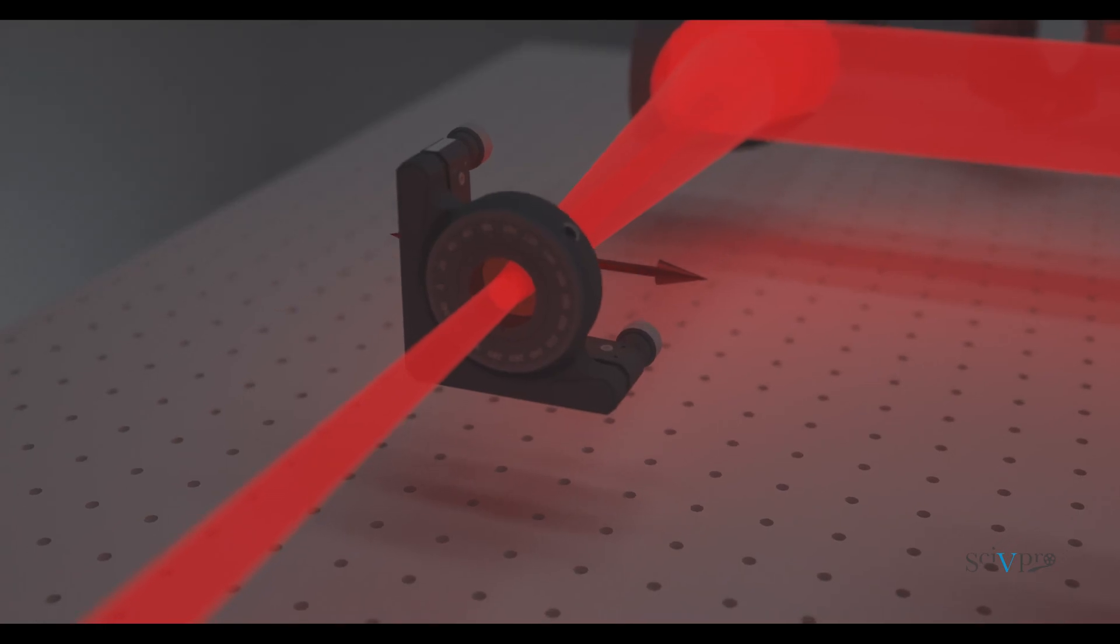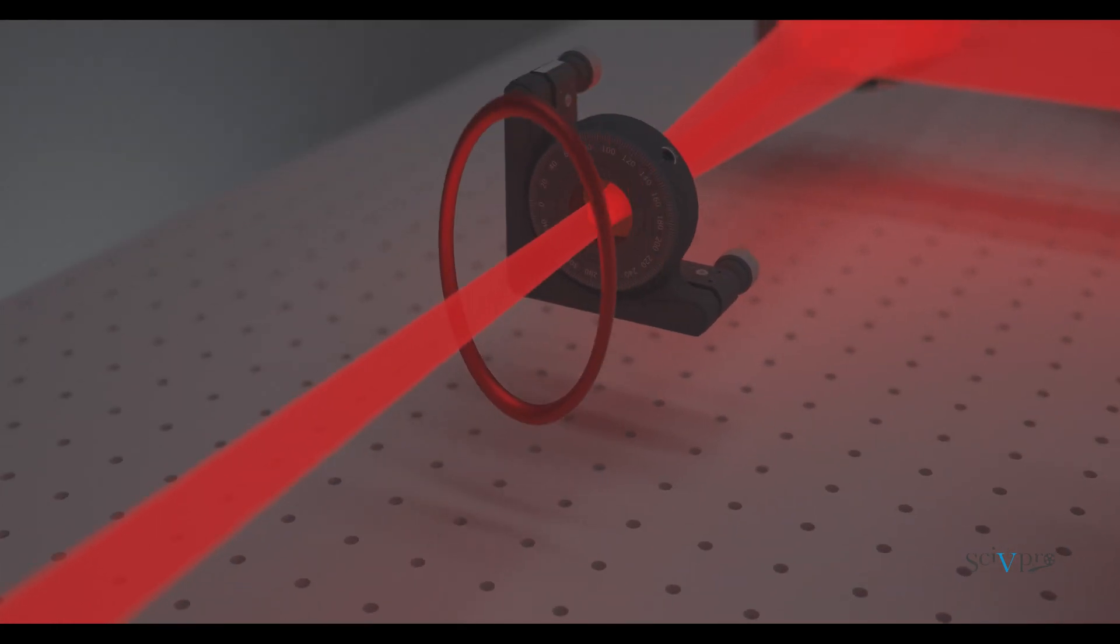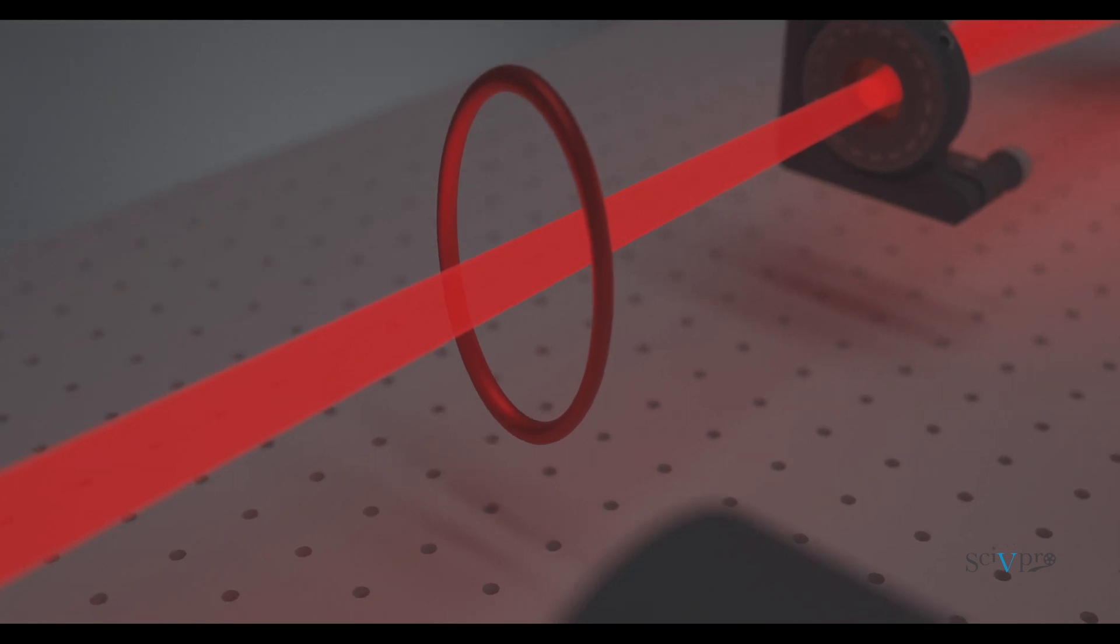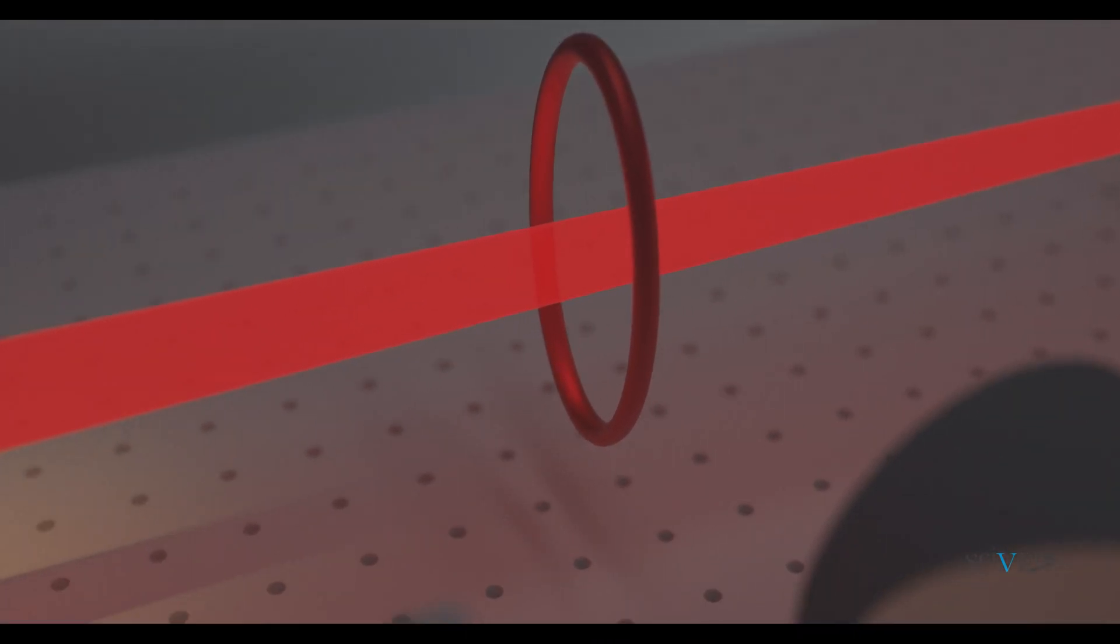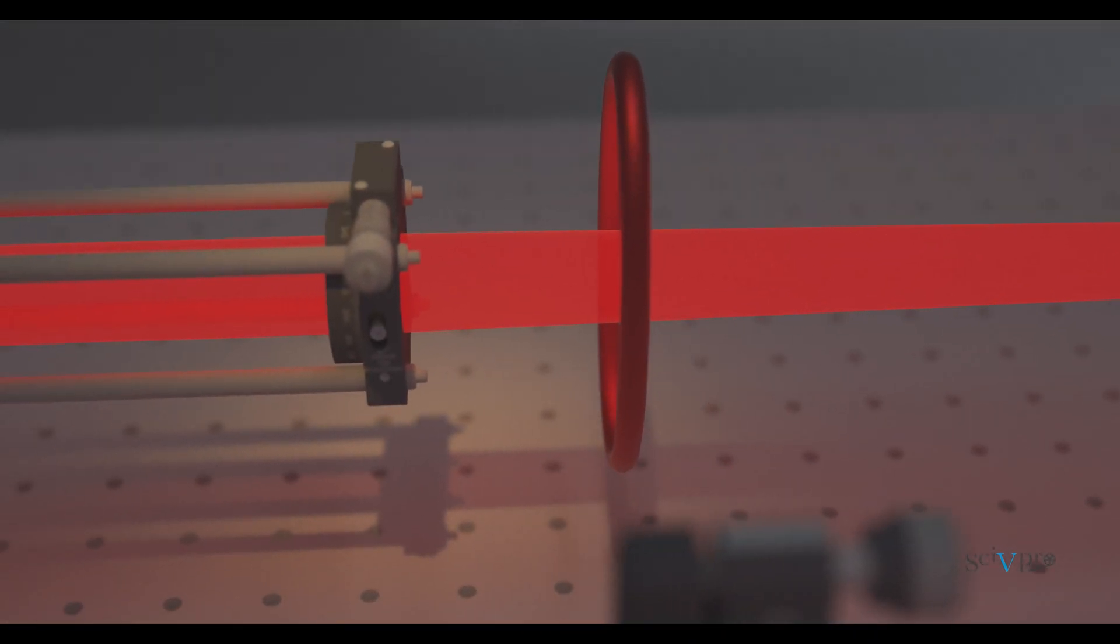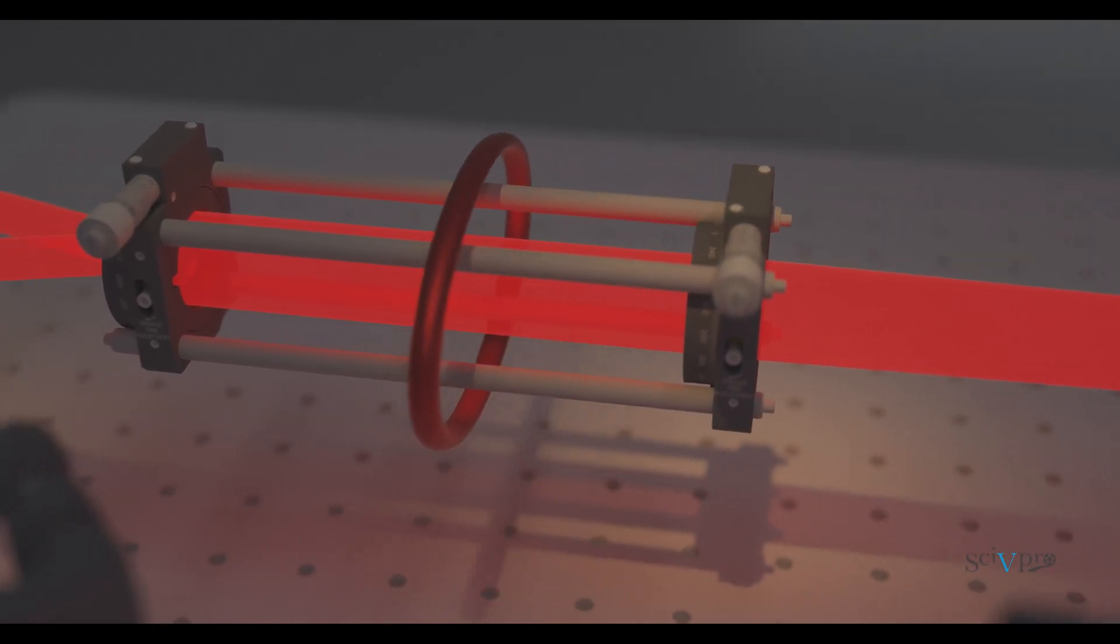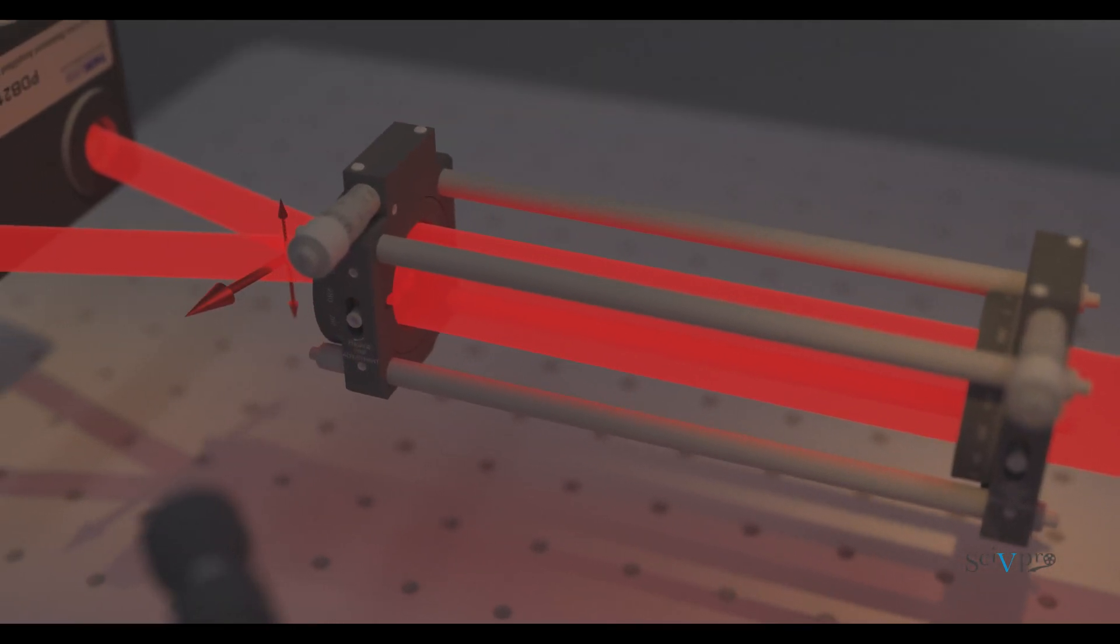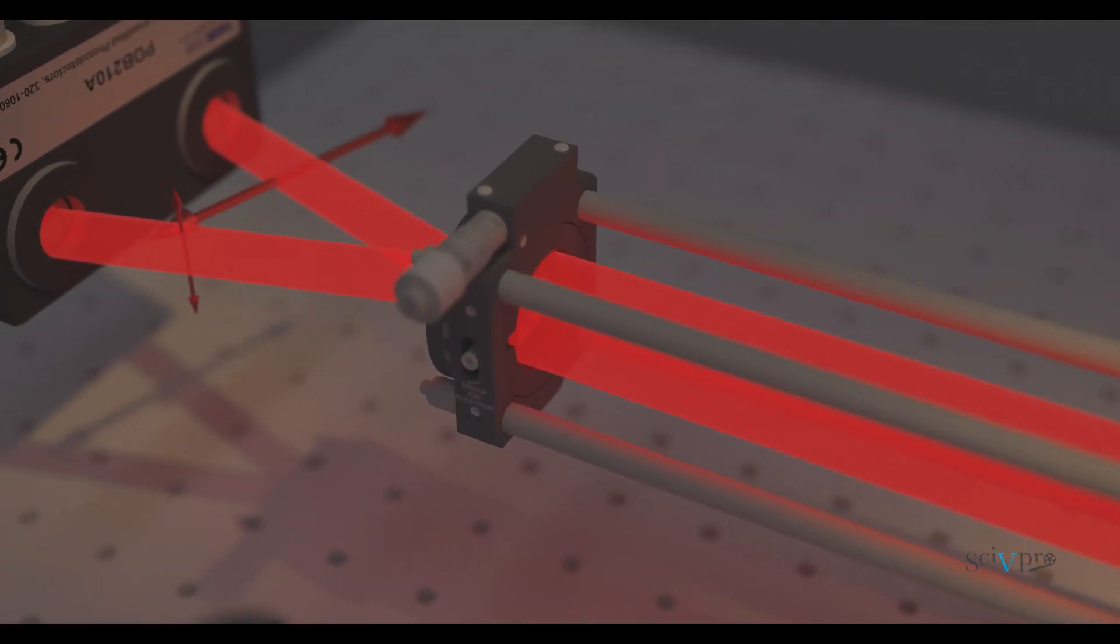Before running an actual measurement, the detection optical assembly needs to go through a calibration procedure without any Terahertz signal. A probe pulse exiting the crystal without appropriate phase would result in a non-zero detector output, even without any signal.